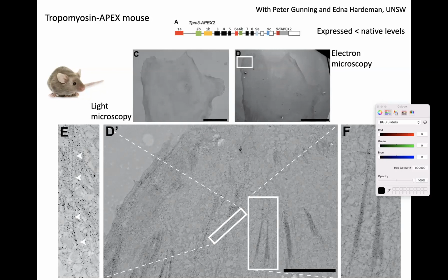And we did a lot of quantitation on this system and various other systems. And what we now know is that if you have the antigens well spaced out, then you can actually get to single molecule detection. So it's very, very sensitive. Of course, we chose a protein that's expressed at relatively high levels, but this is actually below the native levels for the tropomyosin. So we have very good sensitivity and we have very good detection. So we're very excited by this. We're using it in a lot of different studies now in the lab, and we hope other people can use it as well.